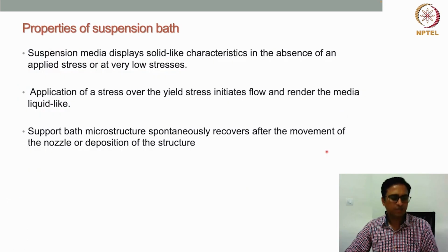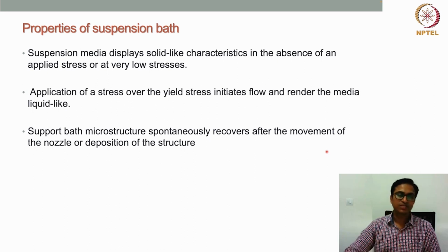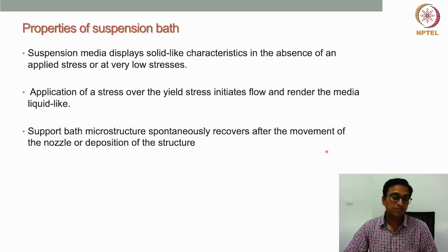Now, what are the important properties of this support bath material? This support bath or suspension media displays solid-like characteristics in the absence of an applied stress or at very low stresses. Right? So that is the very first thing you should remember. The very first important property of the support bath material is that it should not just flow without any applied pressure, or at very low stresses also it should not flow.